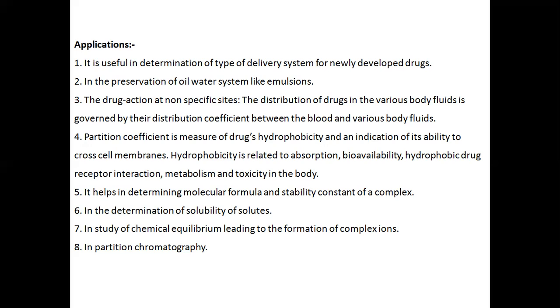It helps in determining molecular formula and stability constant of a complex, in the determination of solubility of solutes, in study of chemical equilibrium leading to the formation of complex ions, in partition chromatography.